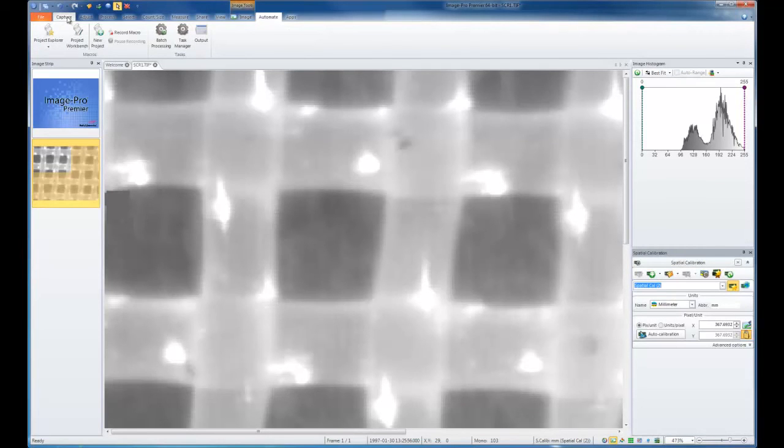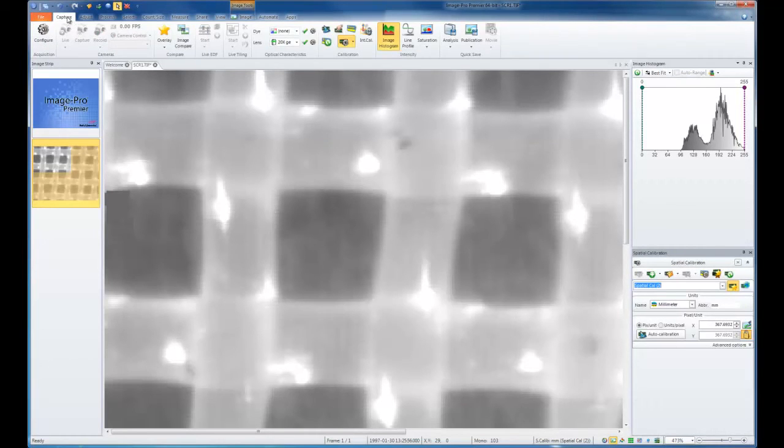If I'd like to save out any information that I've created, I have corresponding export options for each of my tables. If I want to send out information for my image, I have quick save options on my Capture or Home tab to send information to a folder pre-assigned.